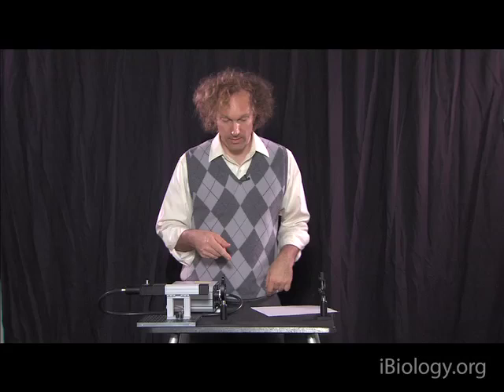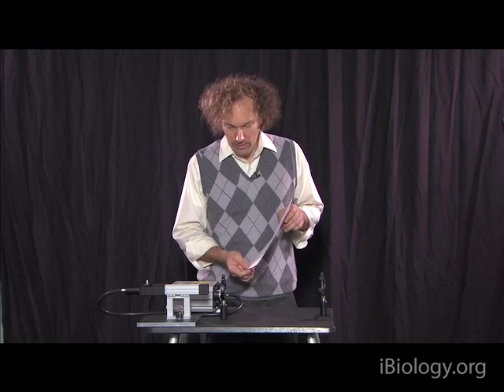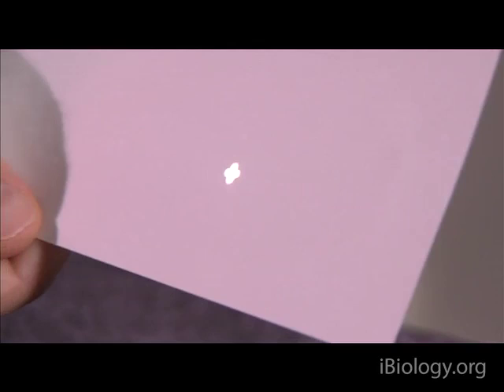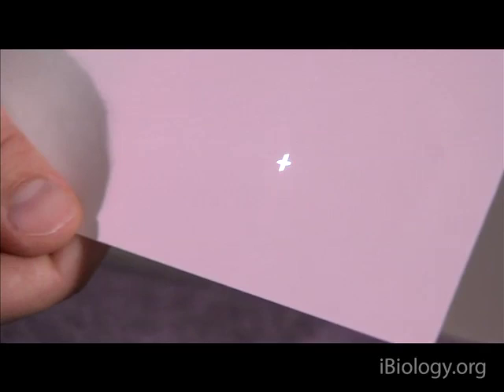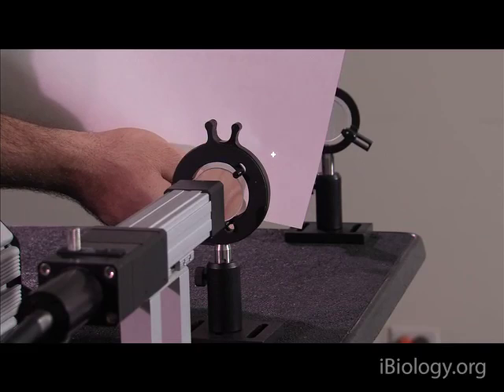Those parallel rays coming from different spots on that cross are coming through this lens. If we look at where the light is, we can see initially there's a nice circle of intensity, and that circle of intensity is going smaller and smaller. Then right where we found the smallest circle of light from the focus of the lens, we see the image of that cross. Now, if you go above it, the image blurs out. If you go below it, it blurs out.